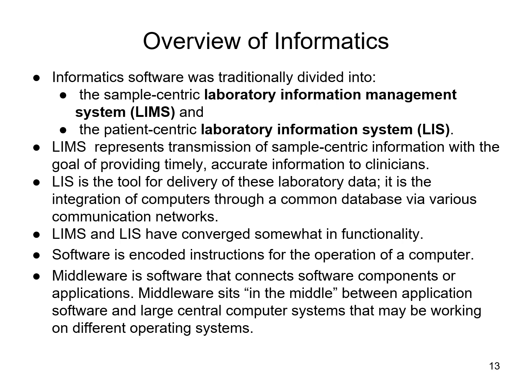We do live in an age where we rely a lot on technology, and part of that would be the informatics, so the computer system, the programs for actually resulting lab results. And that's going to include things like your LIMS, your Laboratory Information Management System, and your LIS, Laboratory Information System. Your laboratory information management system represents sample-centric information.